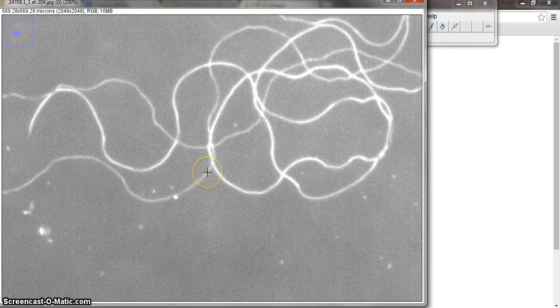I think of it like intersections or like slicing a pie. The middle of the pie is, say, here, and you want to make sure that it looks like it was sliced appropriately. So I can see that this line continues this way rather than continuing this way. And so it's going to continue this way and then keep going up. So you want to follow and maintain the same direction each time.